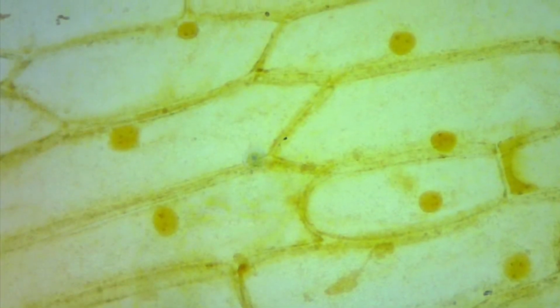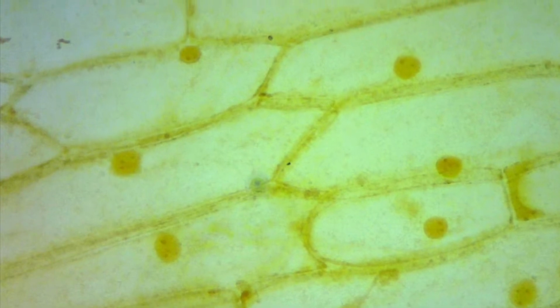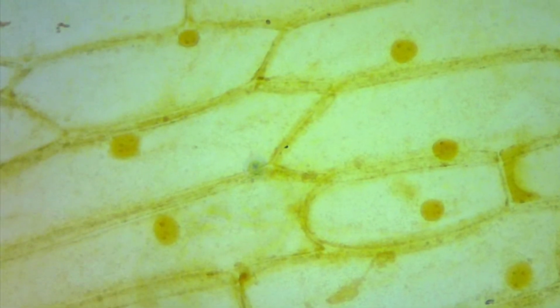There are many structures or organelles that cannot be seen with your microscope. This includes the plasma membrane, as mentioned before. The chloroplasts are not seen either.